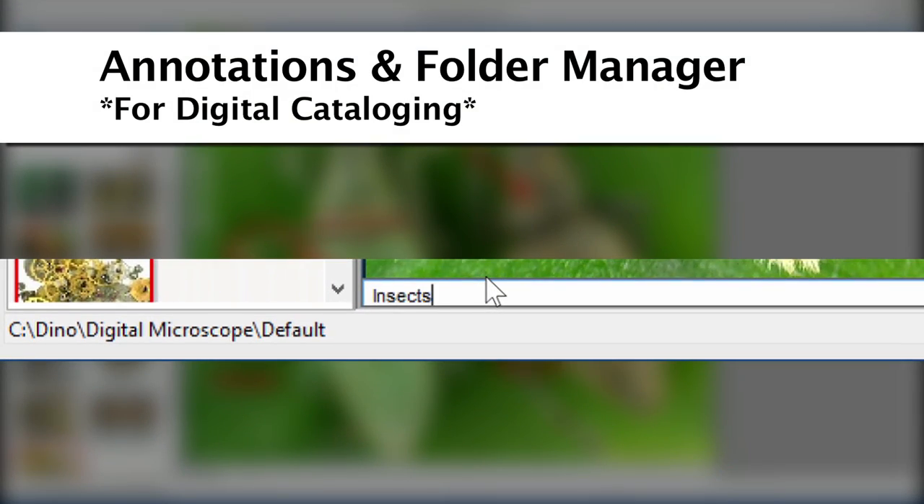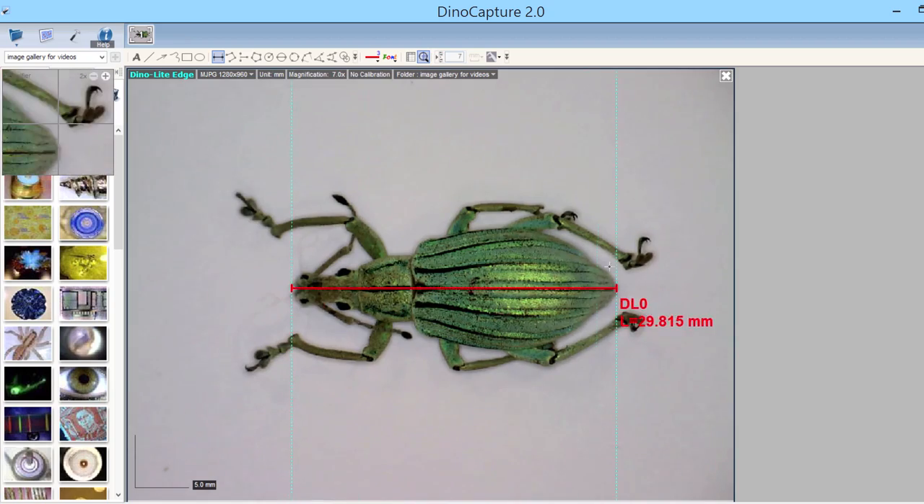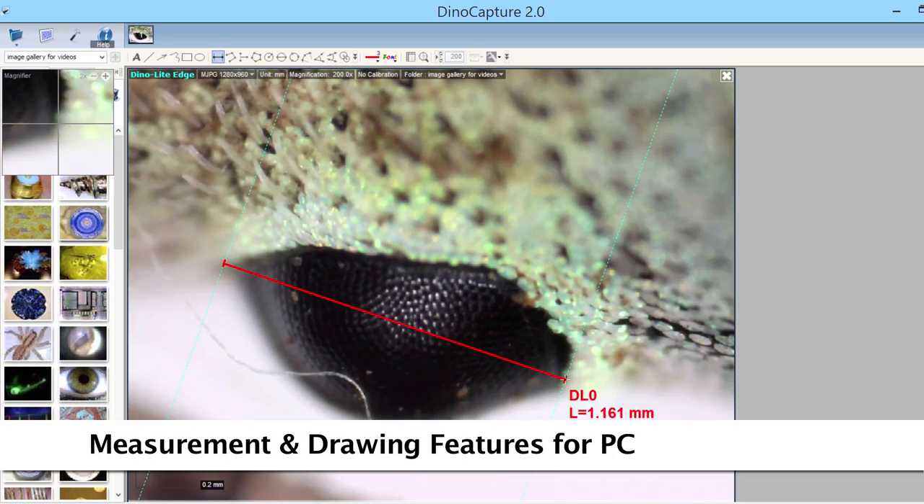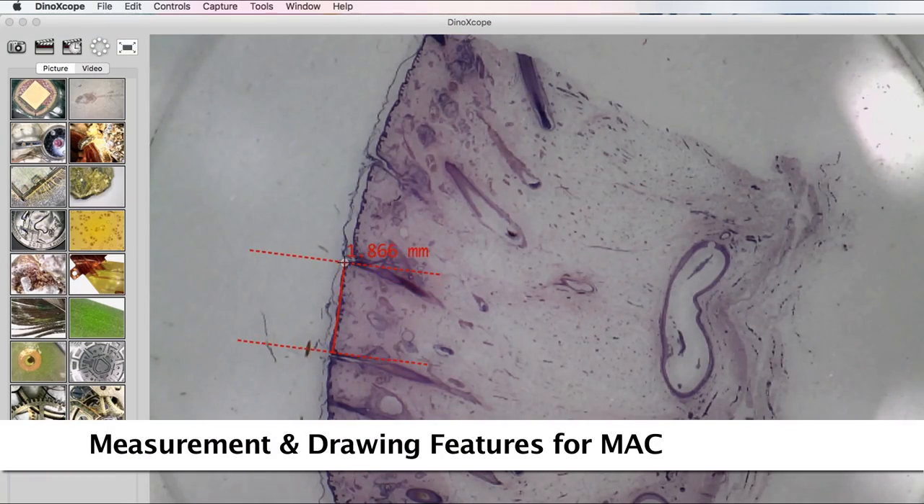Adding an annotation can make images easily searchable. Performing measurements is done easily by selecting the type of measurement and using a mouse to simply point and click on desired beginning and end points.